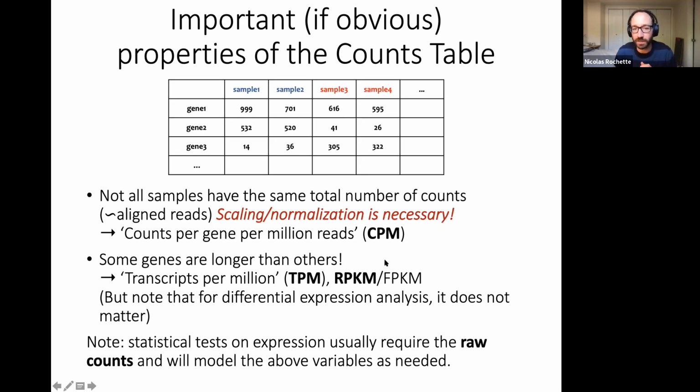So it is skewing the total number of reads by a few percent, usually in one direction or the other, depending on how the highly expressed transcripts fall.